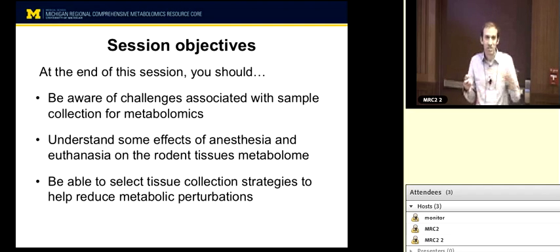Choice of extraction solvent, as I mentioned, that's something that affects us, and that's been studied to no end. Analytical method, reproducibility, sensitivity, linearity, all of those things are relatively well studied, as they should be. Sample collection strategy for cells has been reasonably well studied. There are lots of different techniques, and we have a well studied technique, available on our website, as a strategy that you can use to collect samples and to quench metabolism for cells.